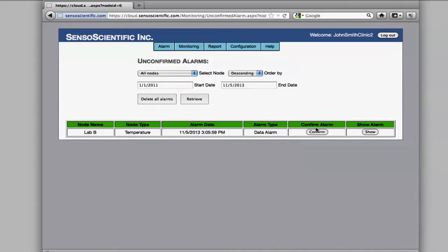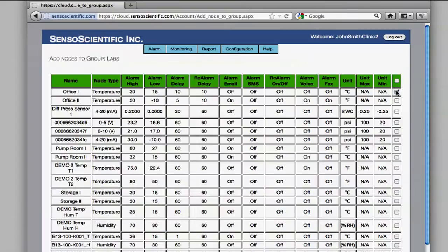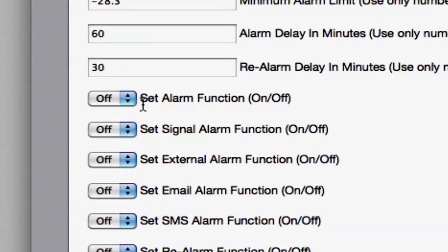From the cloud, you can confirm alarms, run graphs, customize preferences, group sensors by location, and even set up personalized alert notifications for temperature limits.